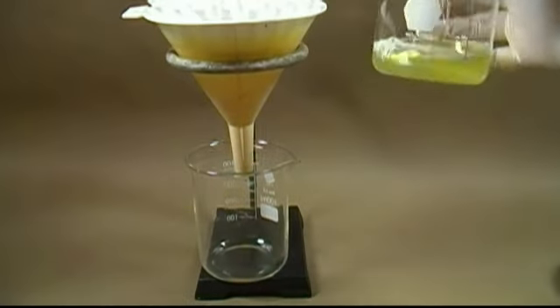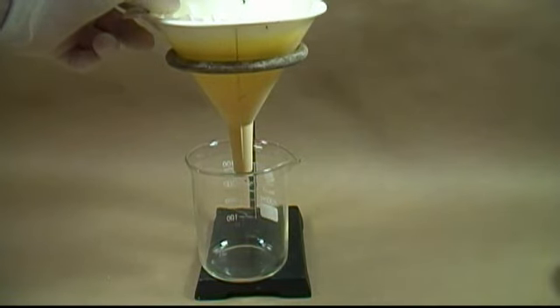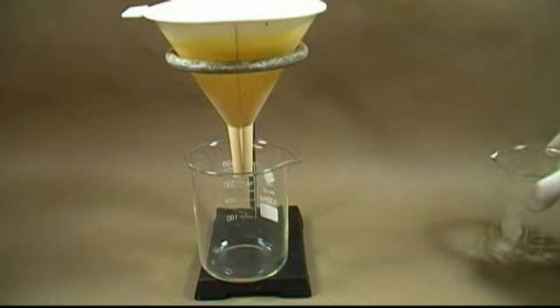After everything is thoroughly mixed it'll be time to filter the mixture. Set up for simple gravity filtration and pour in your mixture. The egg whites will slow the filtration down to a crawl. I've found that using a paper towel works just as good and a lot faster, however if you have time most of it will go through the filter.